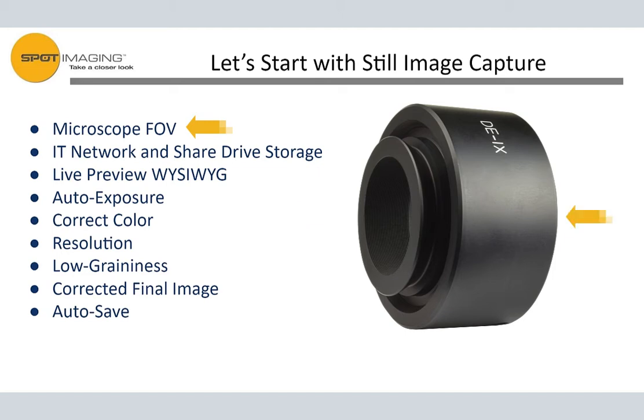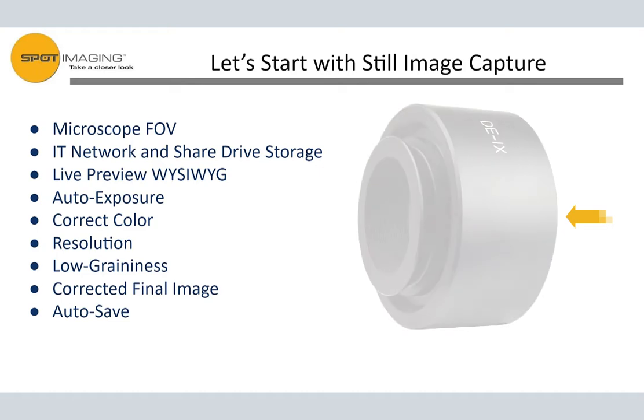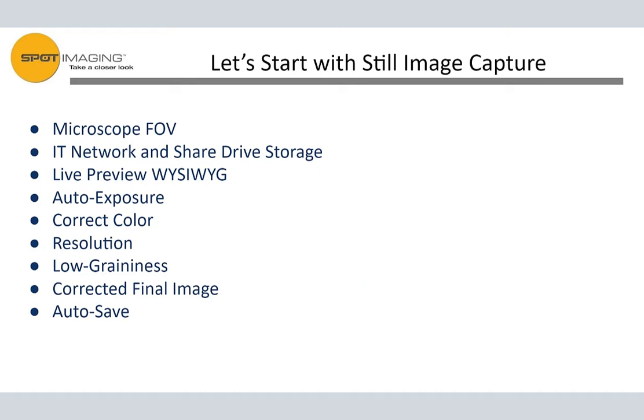The top part is the magnification and C-mount generally, and it is made with the finest semi-apochromatic glass, highly corrected. It sets the magnification so that what you see through your eyepieces will fit on the chip of the particular camera that you have. That's why whenever we do these quotations and setups, we generally want to see your microscope, and we make sure that we can match to your microscope, as well as provide you with a magnification in the optical adapter to get good fields of view.